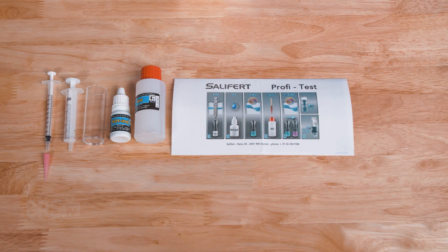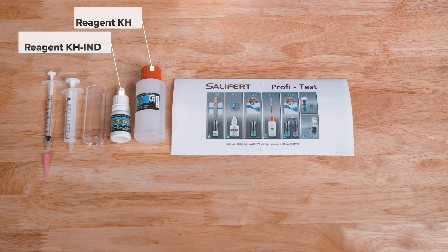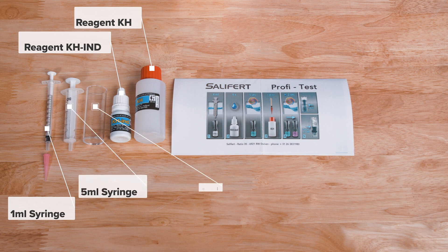In the box you'll find reagent KH-IND, reagent KH which is the titration solution, a one milliliter syringe with pink collection tip, a five milliliter syringe, the test vial, and instructions with a quick reference guide.